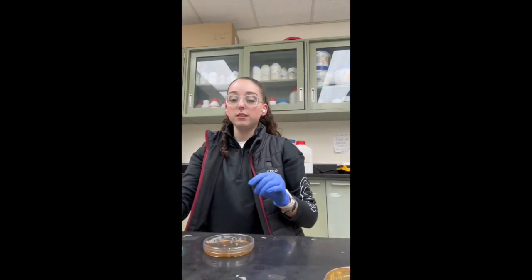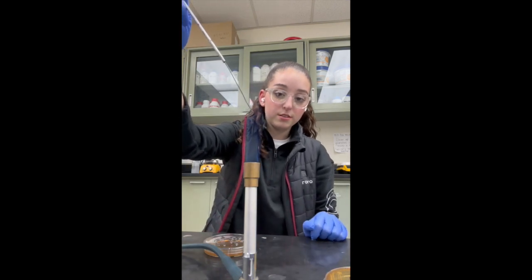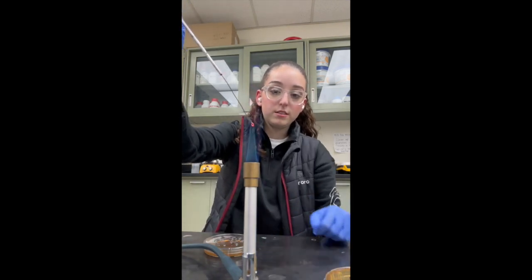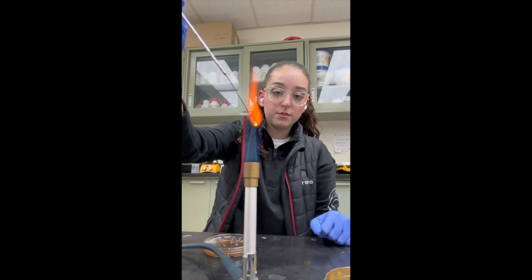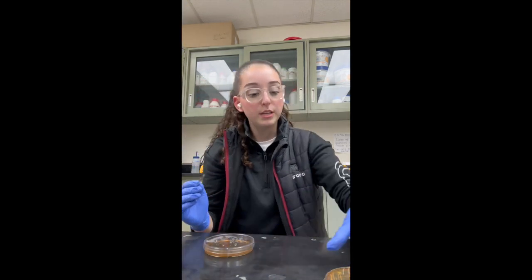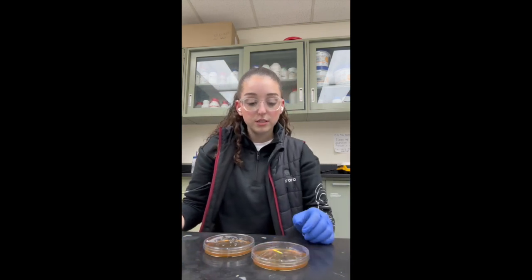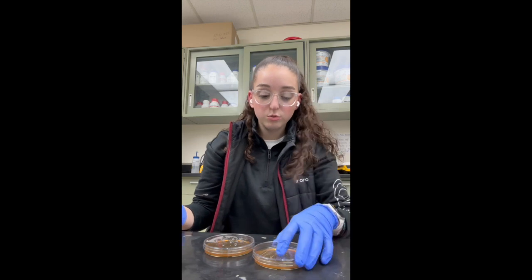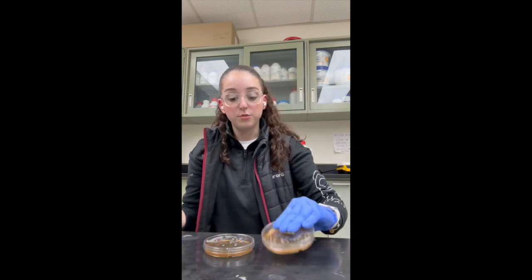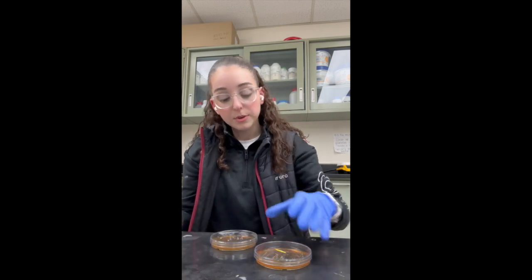To do that, we're going to flame our loop here. Get it nice and hot. I'll let it cool off for a second. We'll be able to do this in one quick swoop. We're going to do the unknown A first. Check that my loop is cool. I'm going to make sure I put them in the right spots.